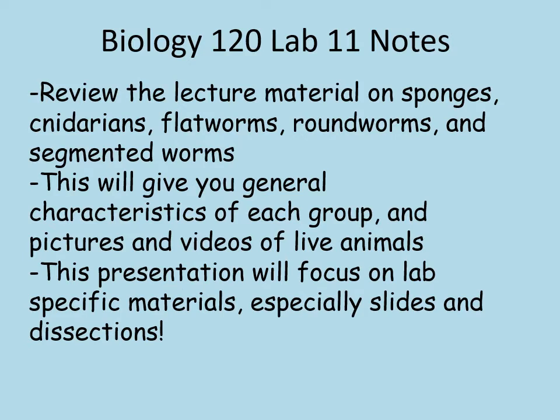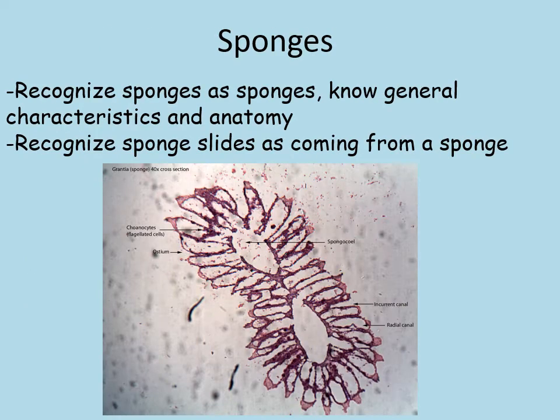So this presentation is going to focus on lab-specific materials, so content you would have seen in the lab if we had the meeting. So especially slides and then the information about the two dissections that we were scheduled to do in this lab. So let's start with sponges. So again, look through the lecture material.